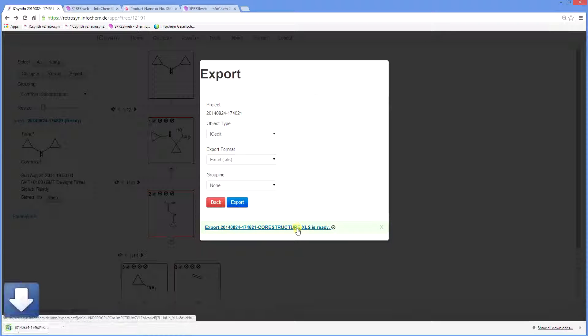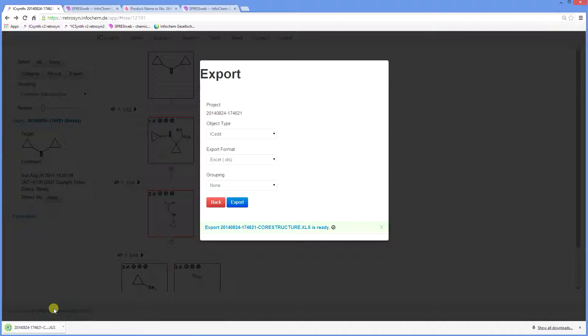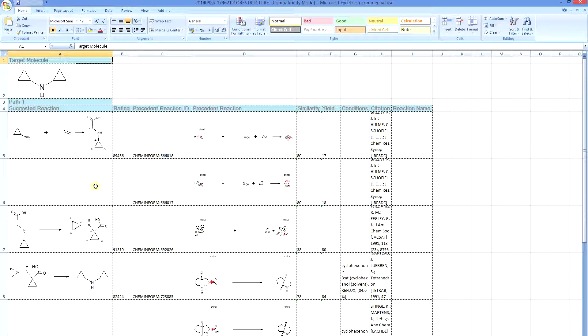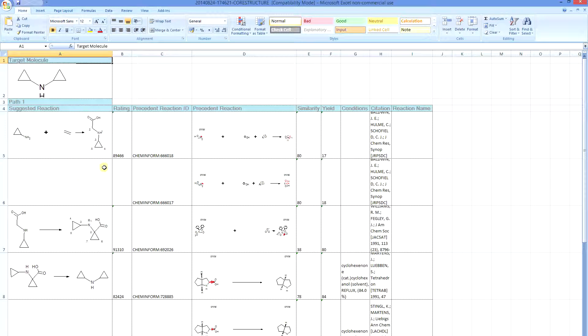Here we see the Excel spreadsheet is ready. If we open it, we can see that it contains the target molecule, the suggested reactions and the reaction conditions along with the yield and citation if they are available. This is useful for your reference and record keeping.